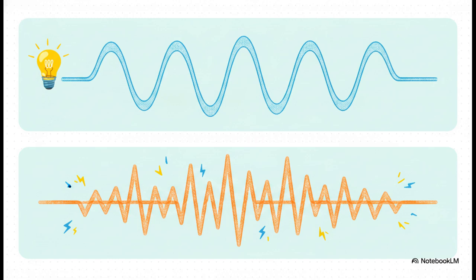Remember our resolving power formula? It relies heavily on wavelength. Because an electron wave is approximately 100,000 times shorter than a visible light wave, the resolution threshold dramatically drops from an optical baseline of 200 nanometers all the way down to an ultramicroscopic 0.5 nanometers.